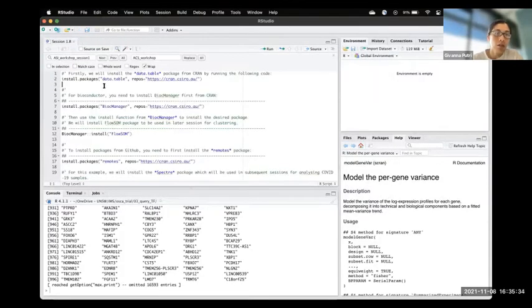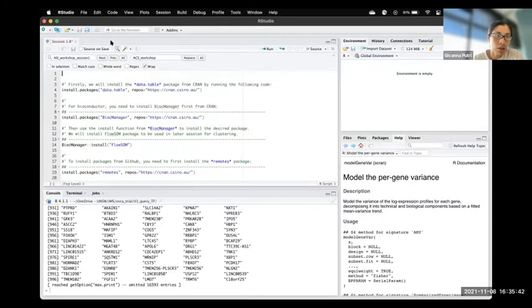So that is that. If you want to run an R code, one way of doing this is, for instance, I'm going to create a sample variable called, say, example variable. So if I've typed some R code and then I want to run it, what I've just typed is basically I want to create a new variable, call it example variable, and store number 1 into it.